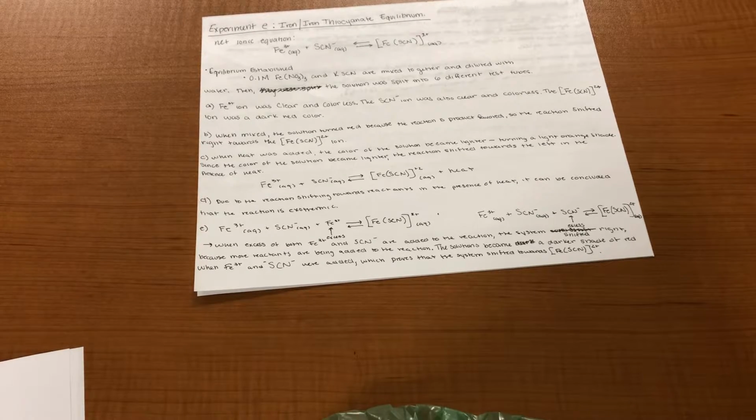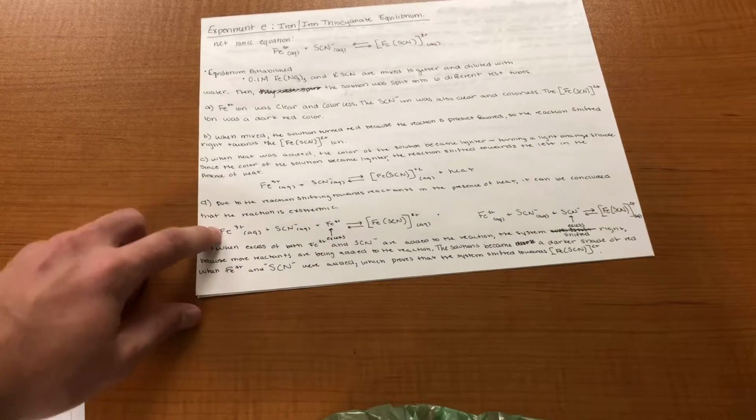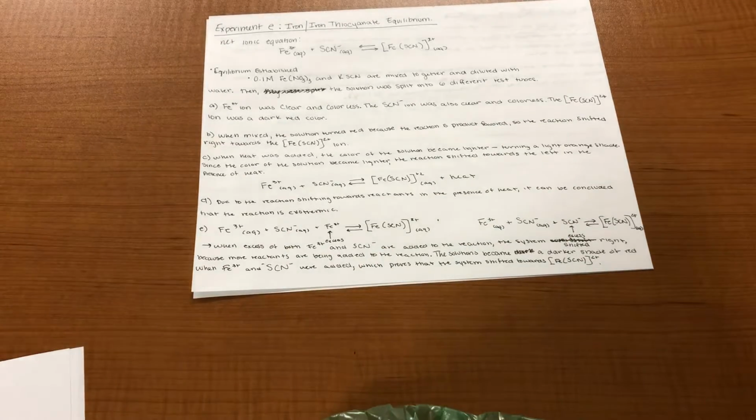When excess of both iron 3 ions and thiocyanate ions are added to the reaction, the system shifted right because more reactants are being added to the reaction. The solution became a darker shade of red when iron 3 ions and thiocyanate ions were added, which proved that the system shifted towards the iron thiocyanate, or the product side. The equations above show the addition of excess iron 3 ions and excess thiocyanate ions, respectively.